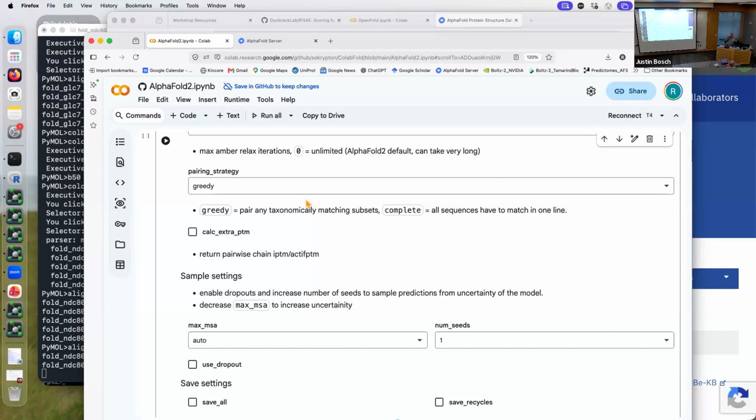So you've got 2 proteins and you search for all the proteins that are related to those 2 proteins. There's a protein in mouse related to this protein and a protein in mouse related to this one, like the closest ones in mice. Then the 2 closest sequences to your targets in cows, and then the 2 closest sequences in elephants, the 2 closest sequences in pandas. And now you've got the sequence alignment where the 2 proteins are all on one line, and all the different species on different lines.